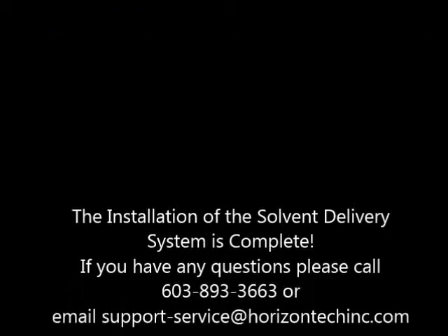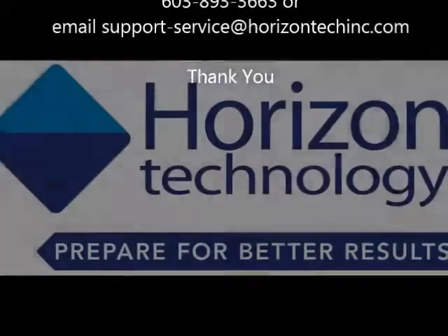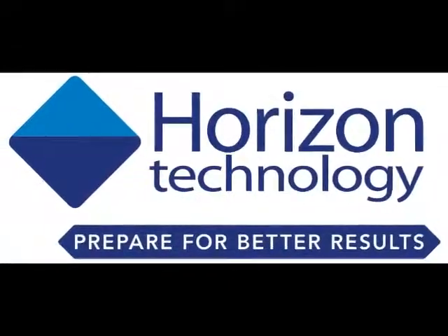That's it. The conversion is complete and you're ready to go.